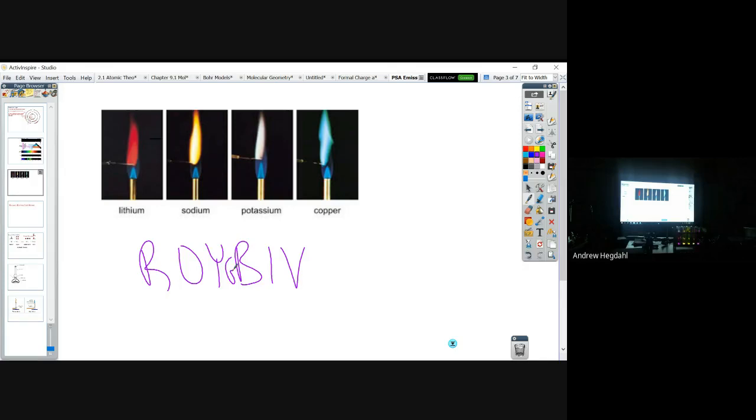So red, we didn't get anything really to happen. Green, we got some things to happen. And now if we use violet, we can get everything to fluoresce, and it fluoresces pretty brightly. And even if I take this glow-in-the-dark hand here, I can instantaneously make things that phosphoresce, that means glow in the dark, like fishing lures and stuff. I can make it glow right away.